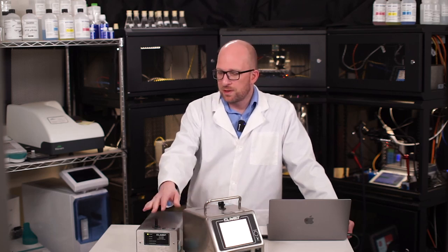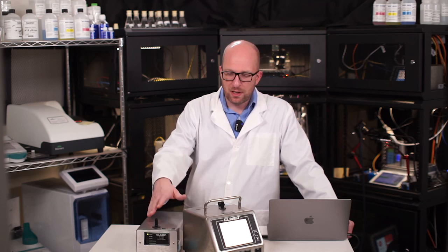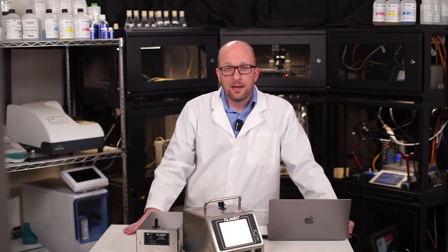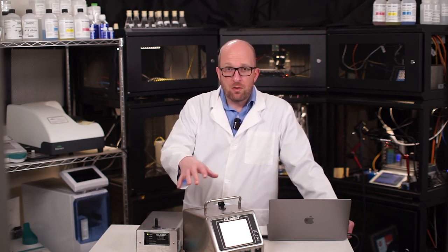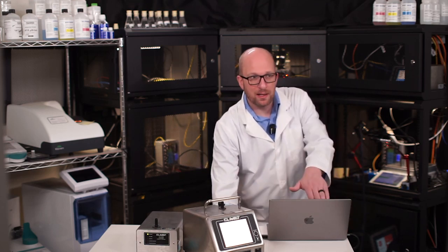This one's a little bit older. This is one of those continuous monitoring kind of fixed units that doesn't have a screen. We can use them the same way. Very, very easy. So I'll just switch over to the web browser here on my laptop.